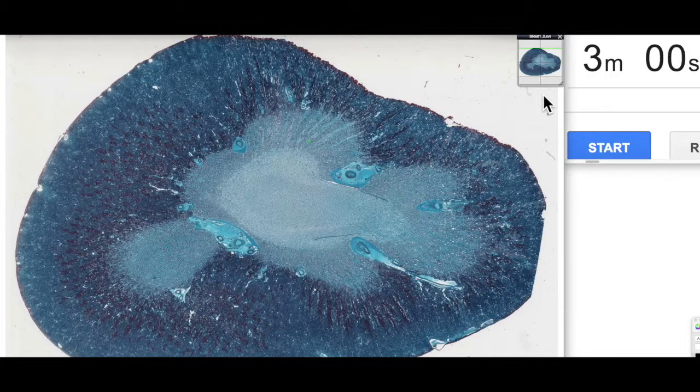Remembering simple means one cell layer thick, cuboidal means that the cells are as tall as they are wide, so little cube-shaped lining cells. Usually we find them in ducts and tubules, and that's where we're going to start today.